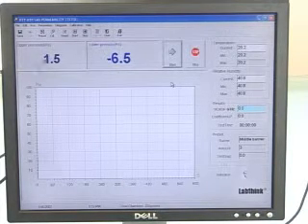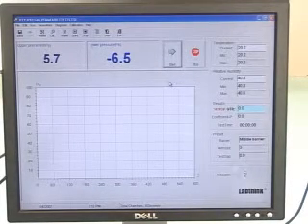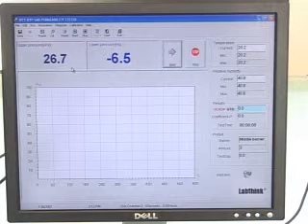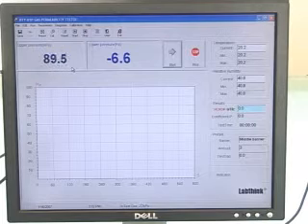At the beginning, the system will blow these 3 chambers one by one. After this, fill the test gas into the upper chamber. When the pressure of the upper chamber reaches 1 atm, the system will begin to test automatically.